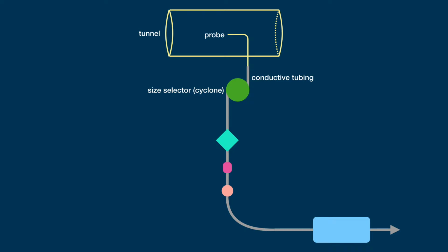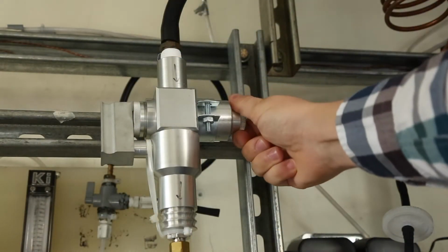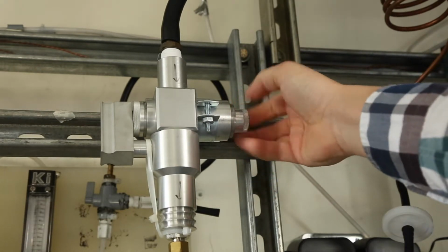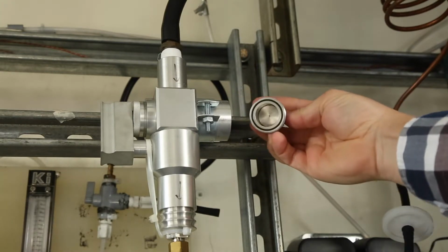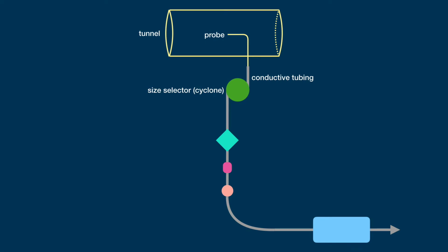Cyclones spin your sample emissions very quickly, causing large particles to fall out of the emission stream. These large particles, which often contain flecks of ash, collect in a grit pot and are emptied daily. Cyclones must be operated at their specified flow rate in order to remove particles above their rated size. If a cyclone is run without sufficient flow, its cutoff size will be higher than 2.5 microns.